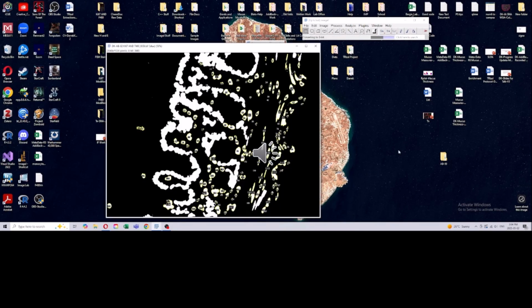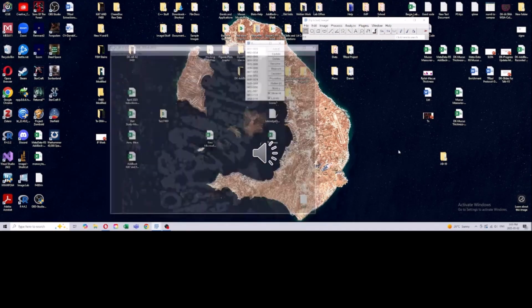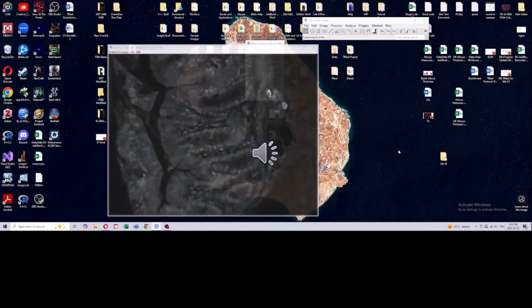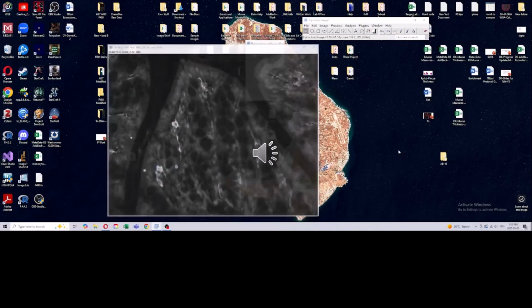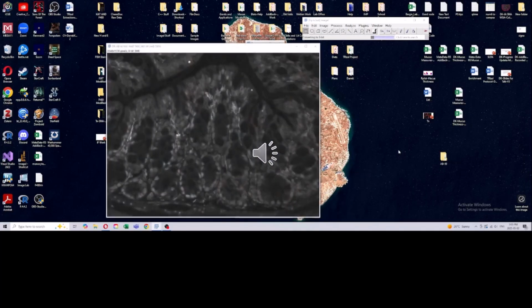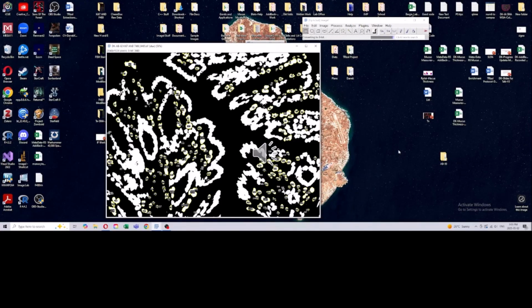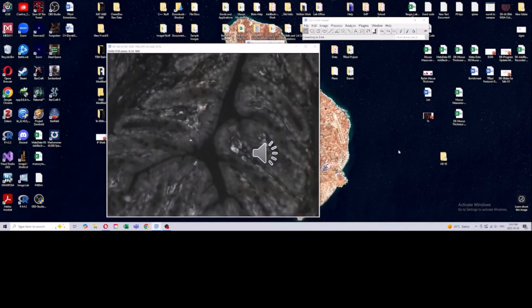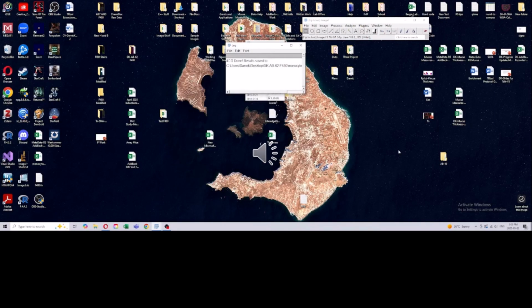It's doing a couple things here. We're converting into grayscale, converting into 8-bit images because that's what it likes to actually process. And then it's actually doing formal counts. It took a little bit of playing around to get things to work properly. I think one of the things I might still change is letting it have a lower threshold for blue, because it does seem to miss some of the DAPI channel a little bit. And there you go. It worked its way through all those images.